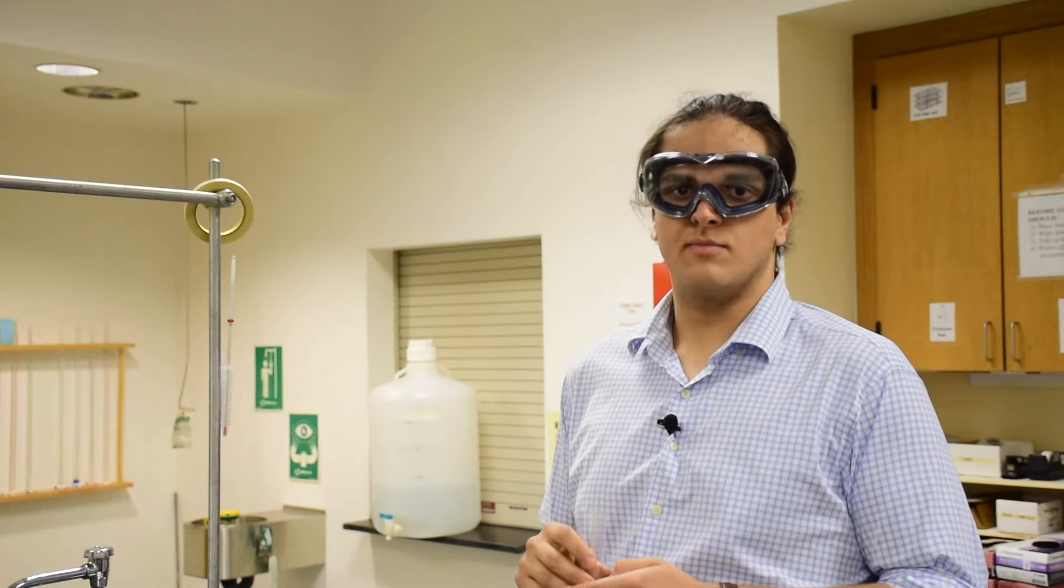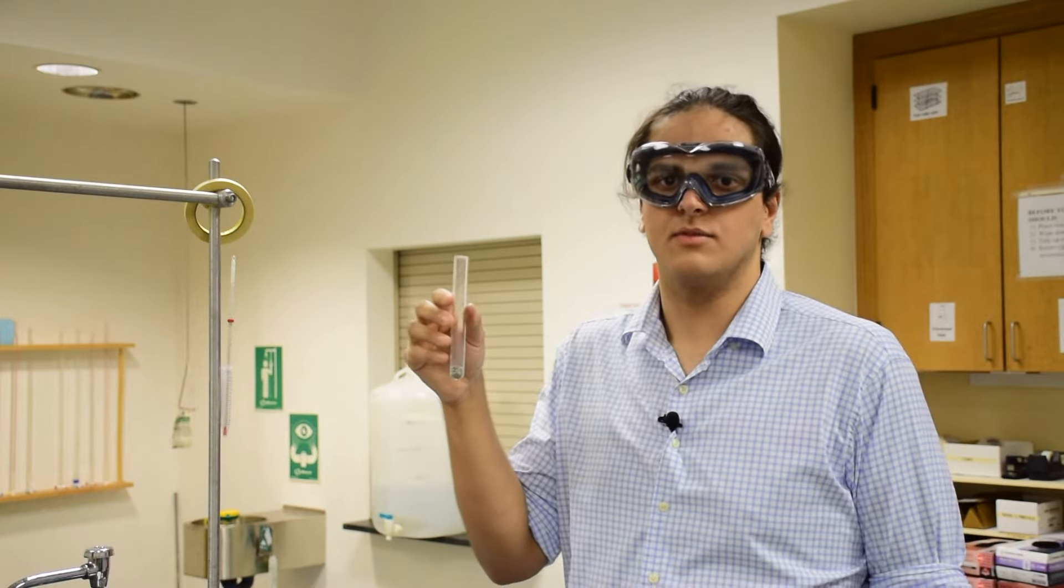In this lab, we'll be determining the specific heat of a metal by measuring temperature changes of water. You'll want to start off by preparing a test tube and putting in 10 to 15 grams of your metal sample.